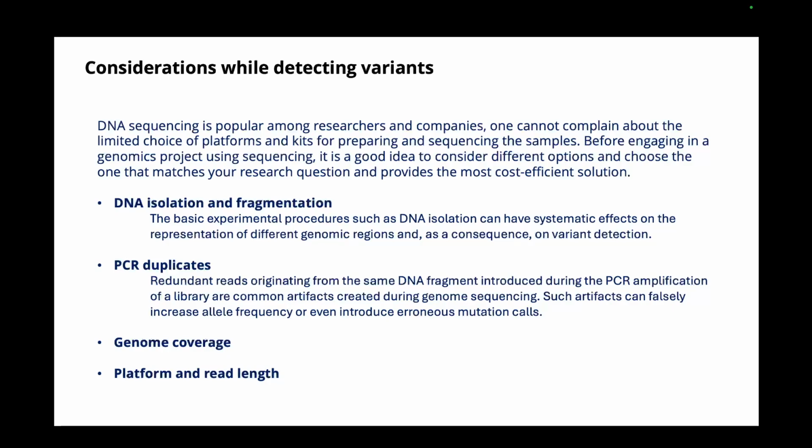So when you're doing this isolation and fragmentation of the DNA, you have to be careful so that you capture the whole stretch of the particular gene or the area of the genome that has the particular mutation that you're looking for. DNA isolation can have systematic effects on the representation of the different genomic regions and, as a consequence, on variant detection.